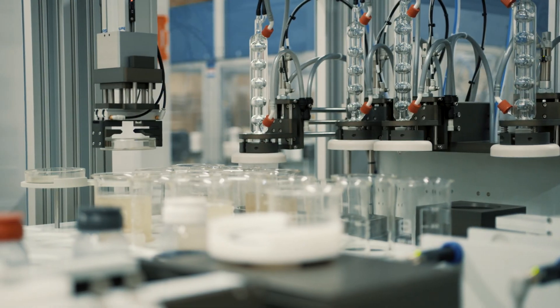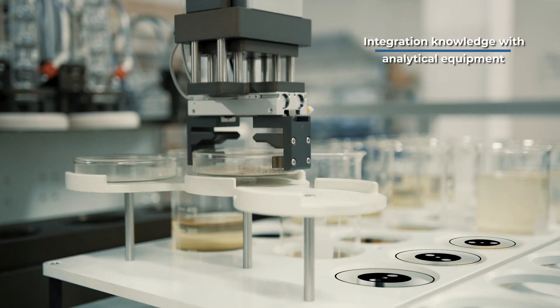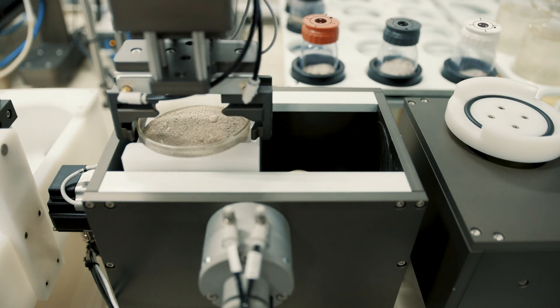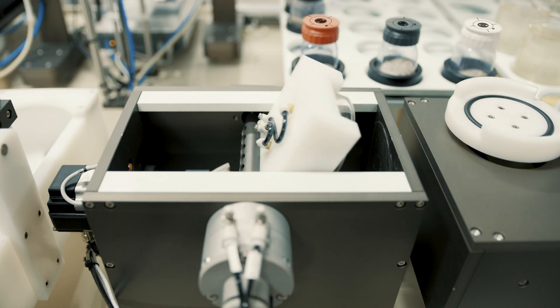Your entire lab analysis, automated and regulated. Leaving more time for your employees to focus on specialized tasks.